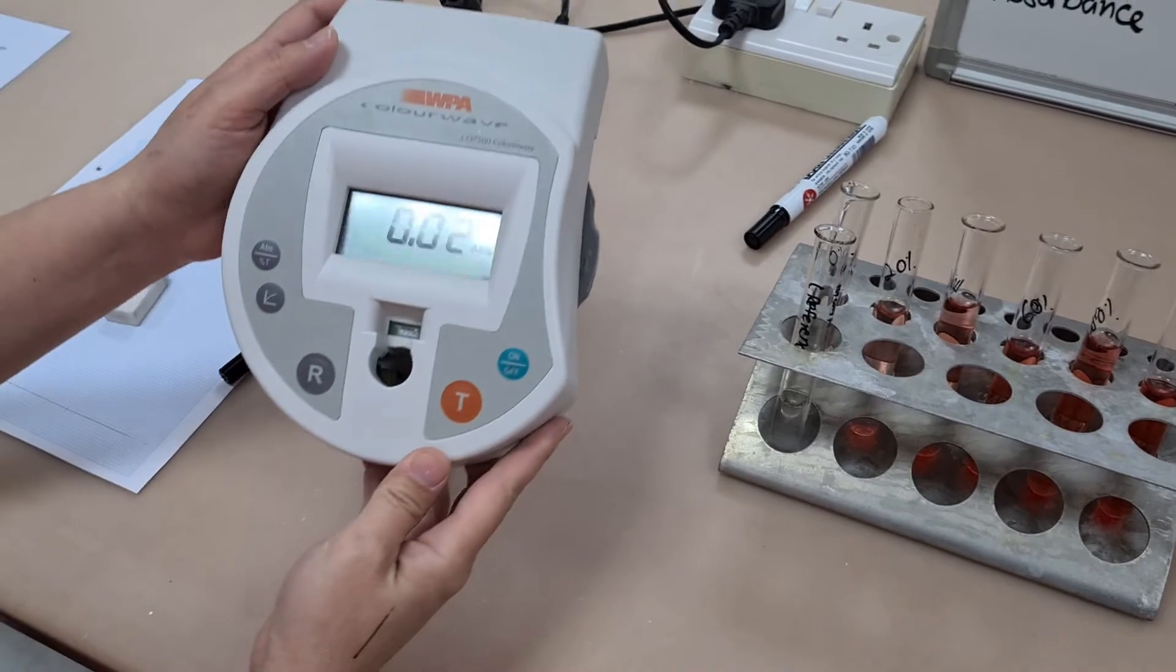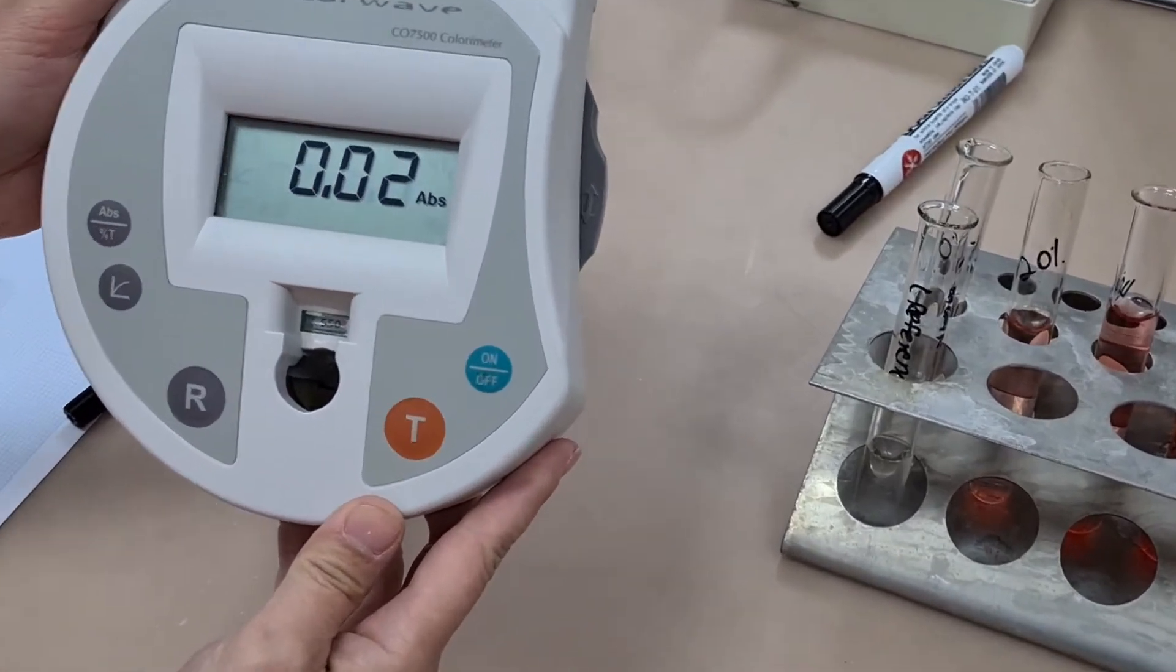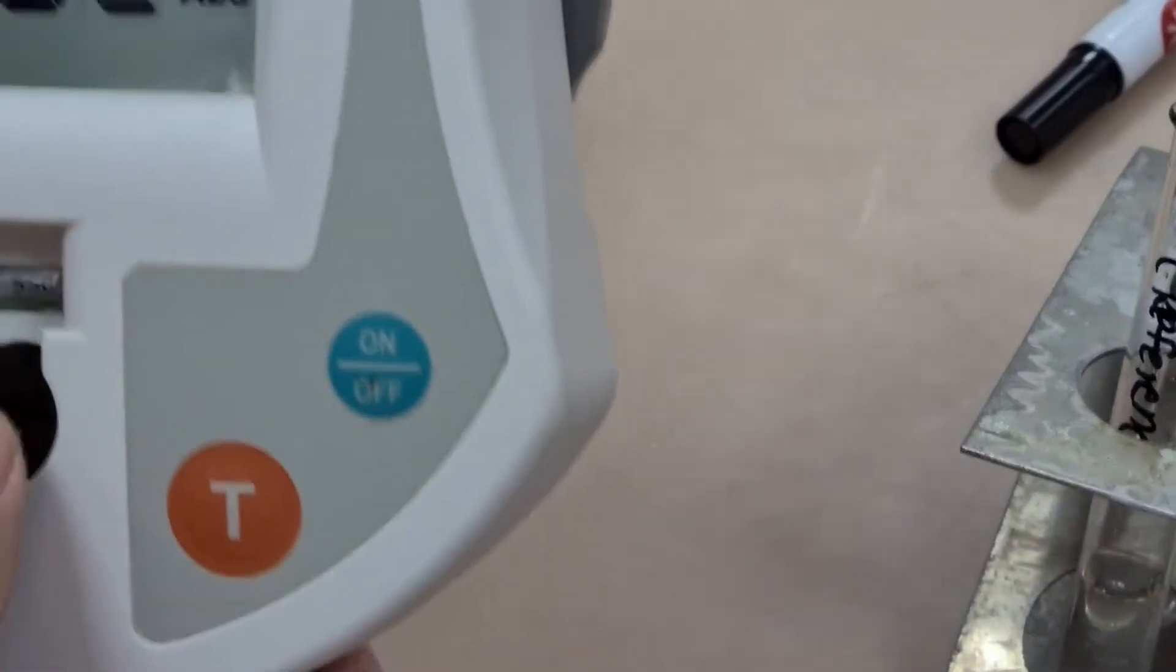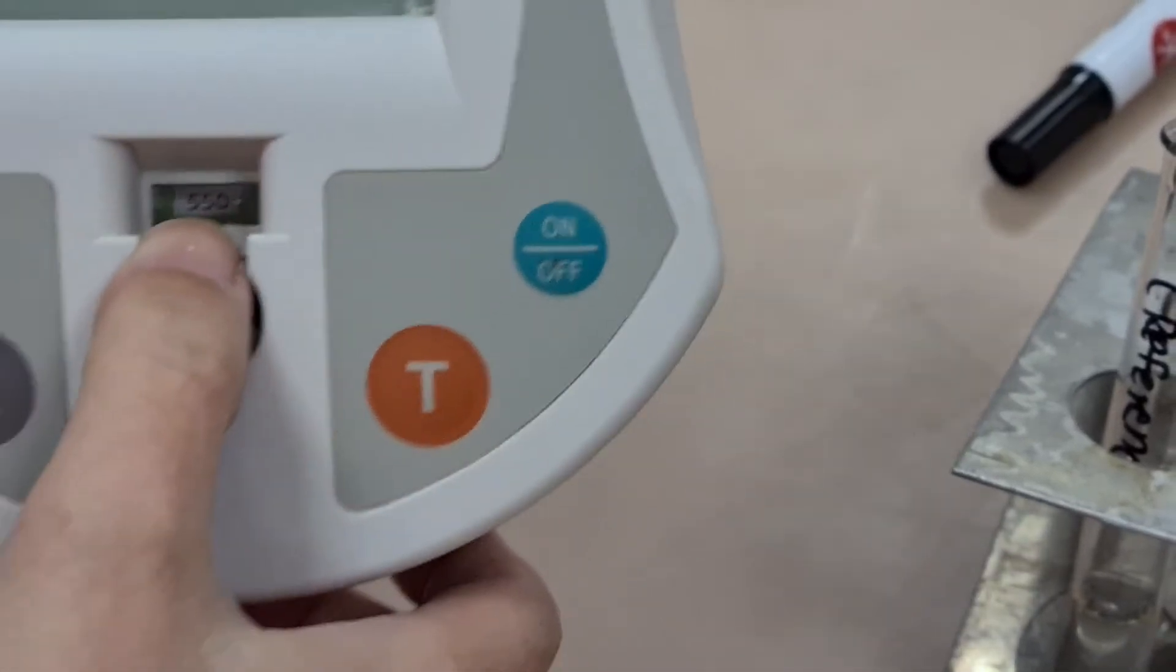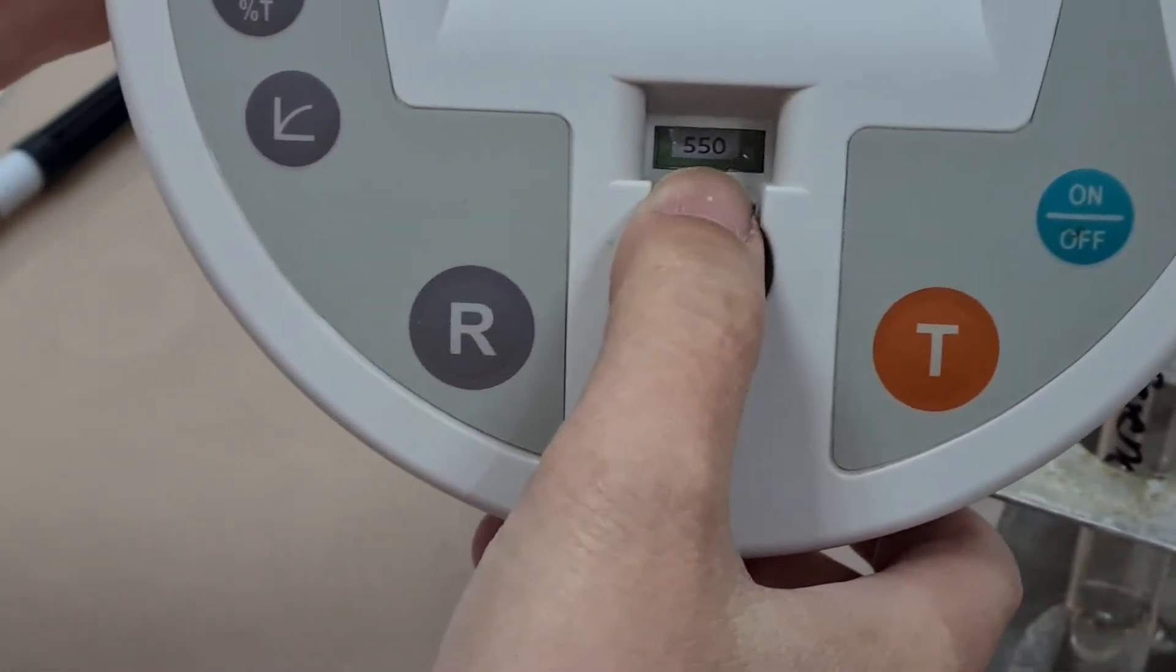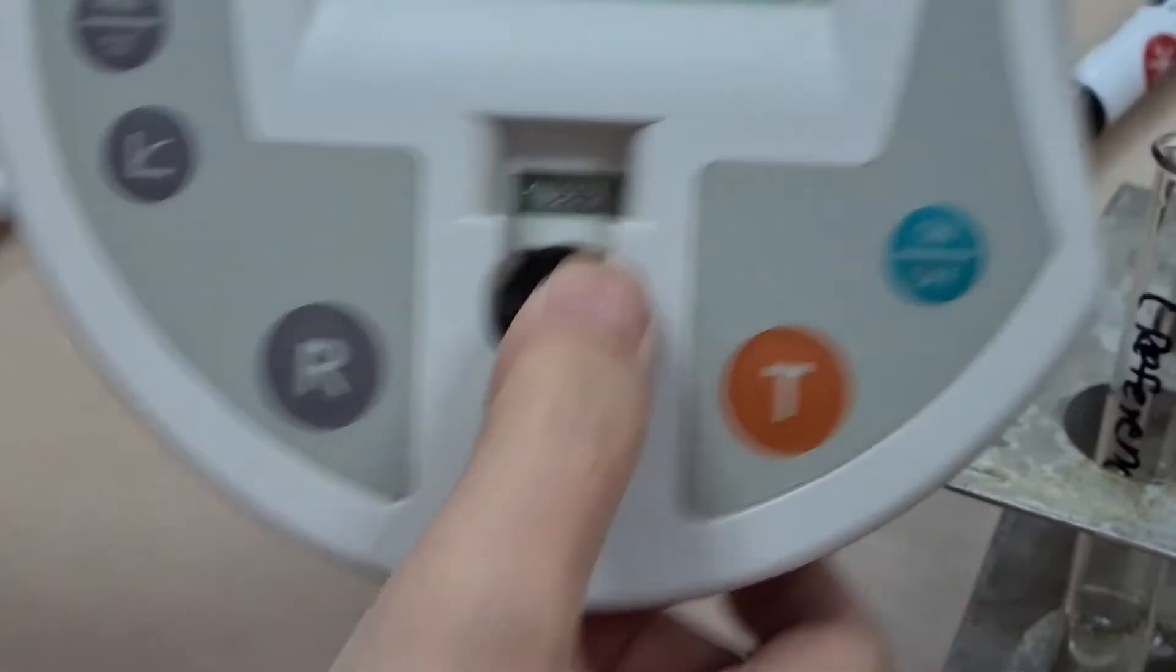Here is the colorimeter and you're going to set it on a wavelength which you can find in the window there. In an experiment you'll get different results depending on the wavelength of light that you choose to shine through your sample.